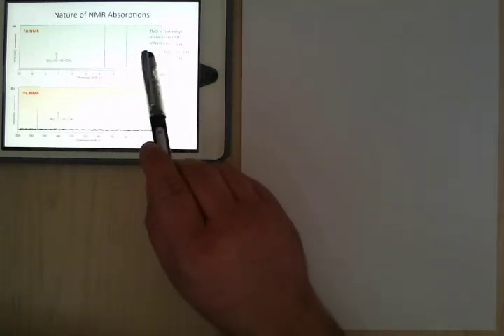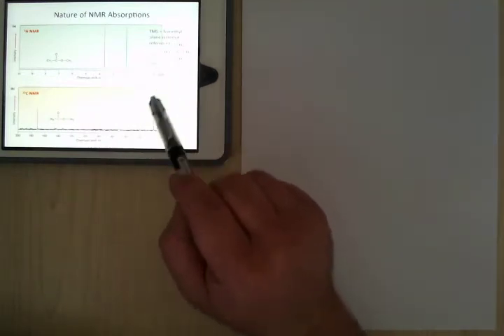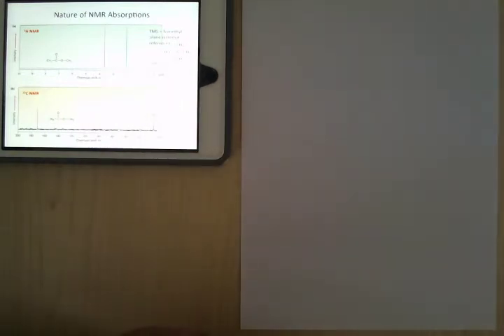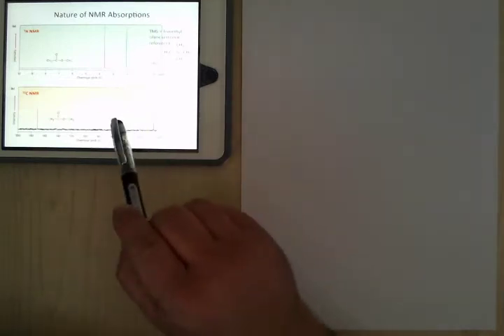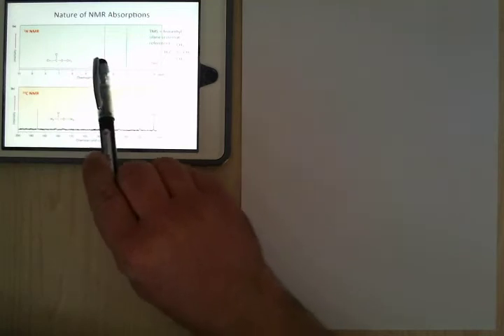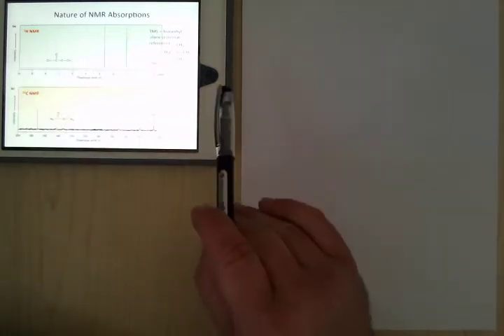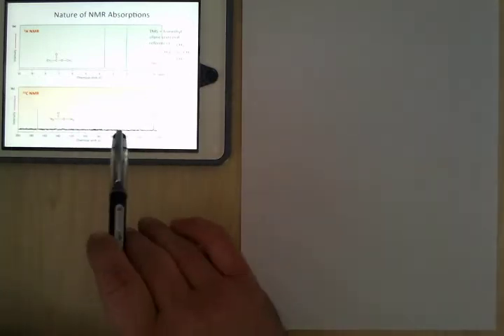And so if we're looking at either hydrogen, or we'll talk about carbon-13 NMR, we see that we can use the same standard for both. But we're going to see signals for the difference in this case for hydrogens, so we can only look at them one at a time. Hydrogen NMR is only looking at the hydrogens. The carbon NMR is only looking at the carbons, right?